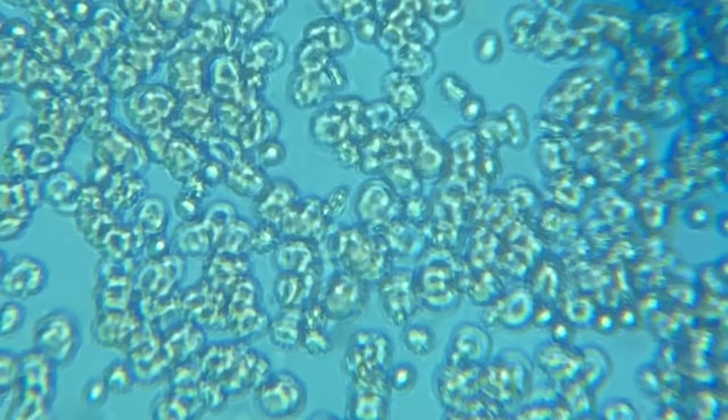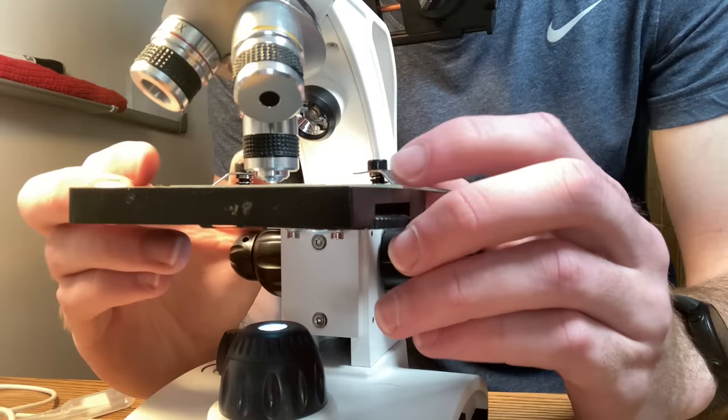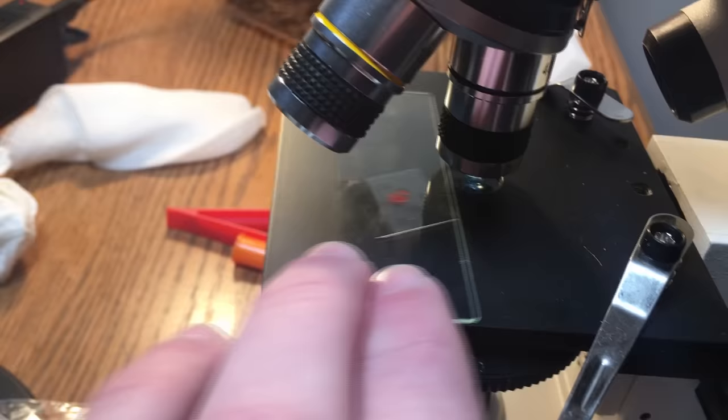You can also see that there is some coagulation going on where the blood cells are binding together and forming clots. But if you look closely at some of the areas in this microscope slide, you can see where the blood cells have started to form weird shapes. My best understanding of what's going on right here is their cell membranes are breaking down, which does in fact confirm we actually got some venom in this sample.